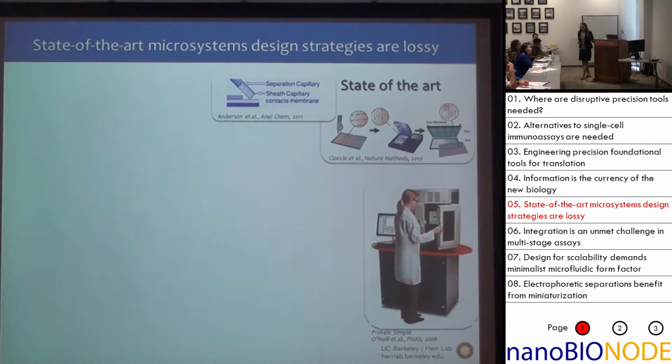So a lot of these innovations are really promising, certainly, but there is one thing that they all have in common that was not really suitable for our work, and that is, and I'm a mechanical engineer, so it's going to be funny that I'm saying this, every single one of these assays required pretty intense automation and robotic handling, right? And again, I'm a mechanical engineer, so I would say one thing I love is, sure, robotics. It's awesome, right? It can do a lot in terms of throughput and automation. But when you go into most single investigator biology labs or a pathology lab, you don't see robotic instrumentation in those labs, right?